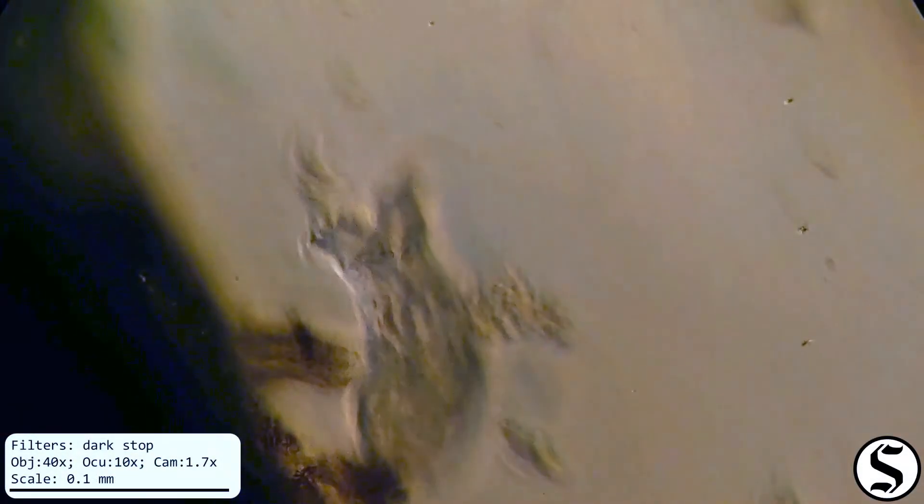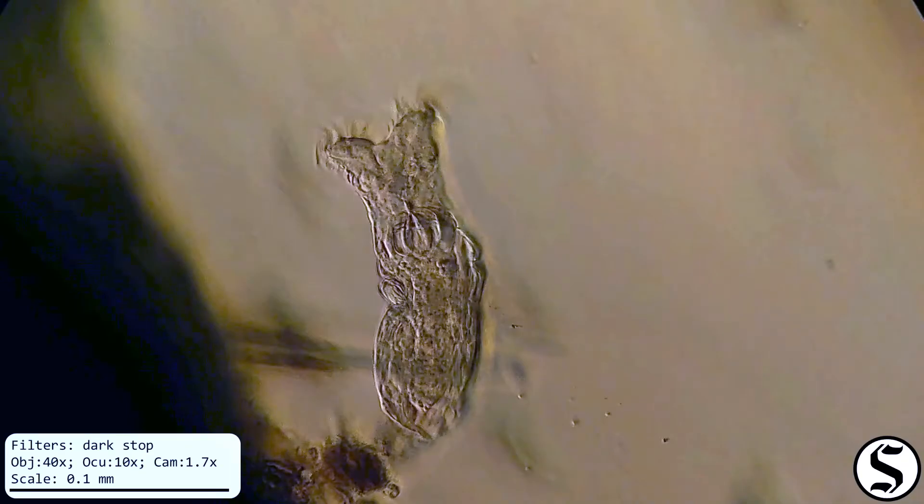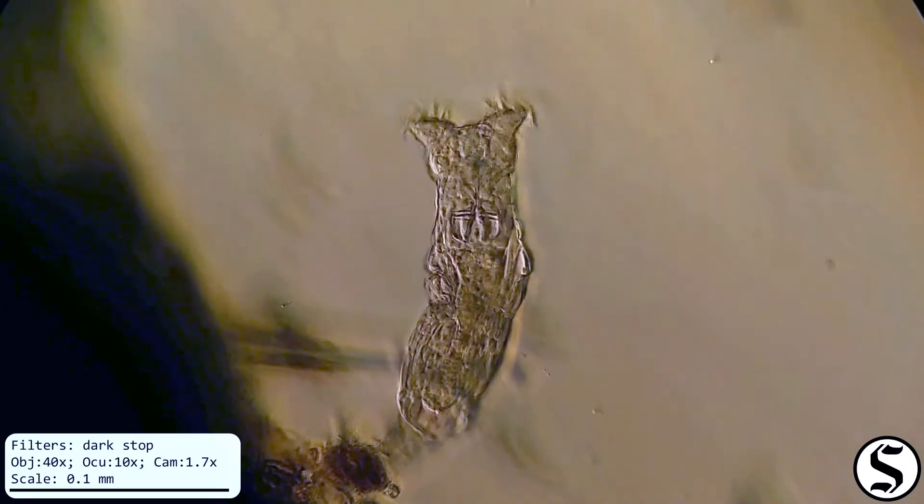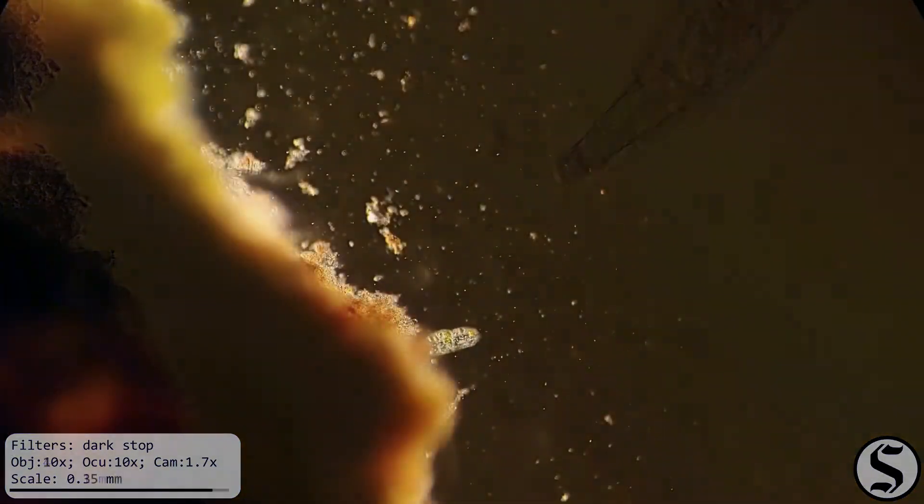And I used some oblique illumination at high magnification. That's a really good shot right there, really shows off the internal structures. But he was really waving around, and then he decided he wasn't too happy with that spot either, so off he went.